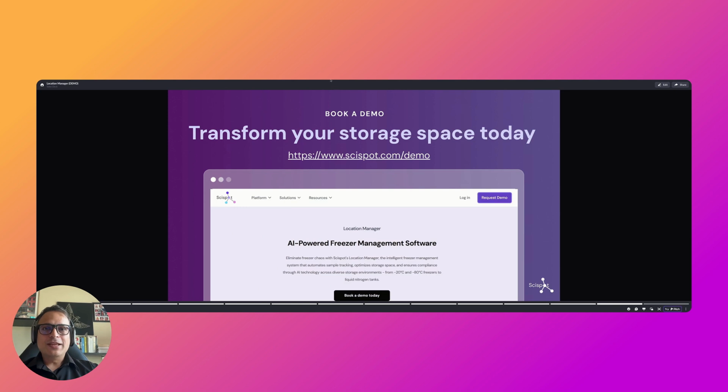Okay, great. So that was a brief overview of the location manager and how AI can help automate your chain of custody, your natural language prompts, and be able to search and retrieve the right samples. If you have any feedback or want to see more improvements on where AI can have an impact on improving the freezer or location management for your lab, please let us know, give us feedback. And I'm excited about where this leads to in a few years. I think scientists would be able to use their voice to ask for the right samples, and also update or edit their samples in their freezer with the right location, while maintaining the compliant chain of custody.